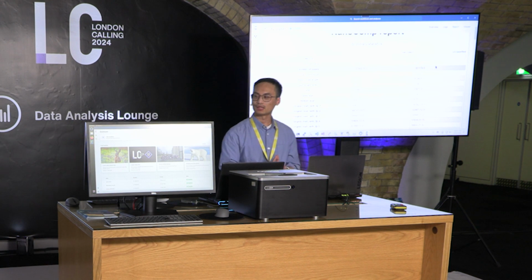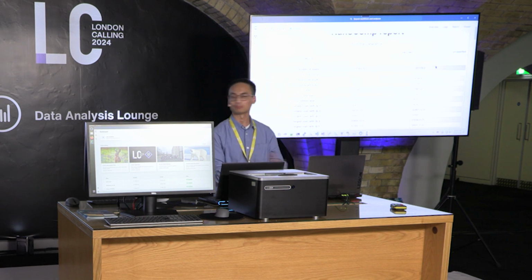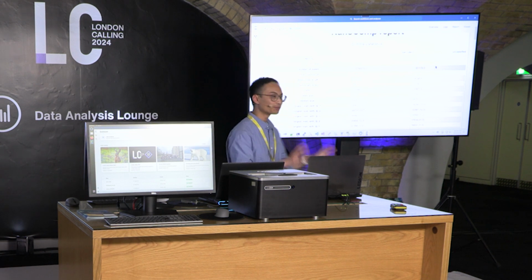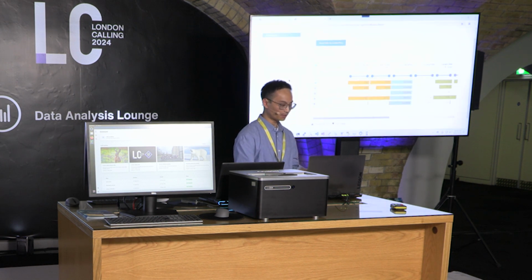The pipeline behind the scenes is also performing taxonomic classification, genome assembly, assessing the genome assembly quality, as well as, most importantly, in silico serotyping. And all those information are being compiled in a separate report, which we will now look at. Now, in the interest of time, I'm just going to directly show you what that report will look like by the end of the run. And so this is what it would look like.